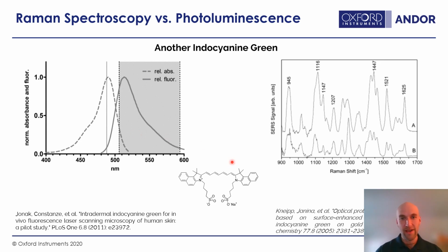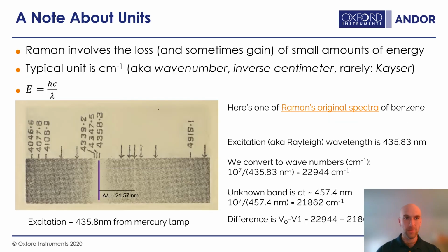On the other hand, here's the Raman spectrum. Well, this is a SERS spectrum, actually, surface enhanced Raman spectrum, but the point stands. This is a Raman spectrum here, and you can see, again, many peaks. What do they correspond to, though? So just real quick, I said, what's the word I'm looking for, incredulously, centimeters to the -1. What kind of unit is that?